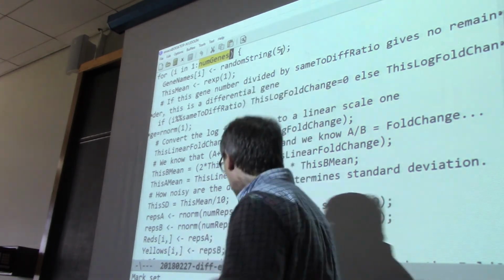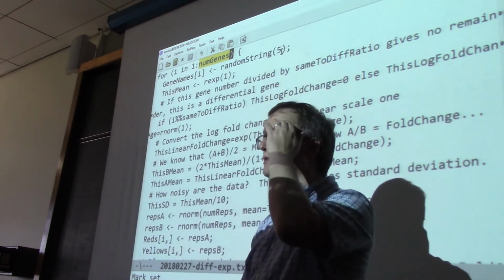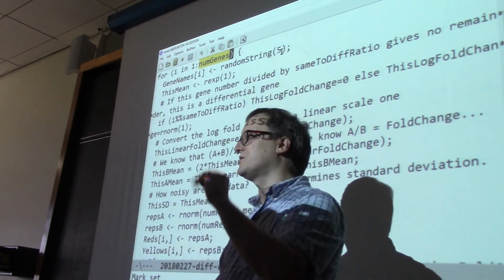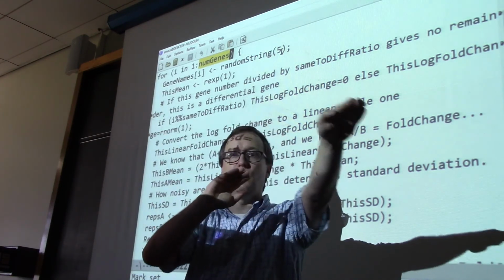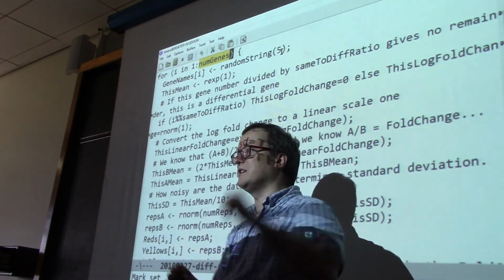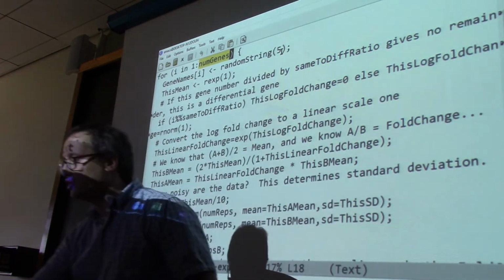So I'm going to show you down at the bottom where we hit the bottom of this loop. But for now, I want you to be thinking, we're no longer concerned with the whole table here. Our focus is on one particular row in that gene table that we need to analyze. So we're starting by populating the gene name part.